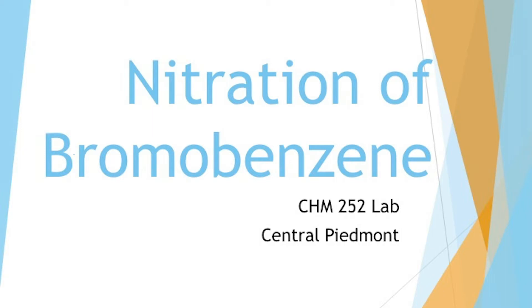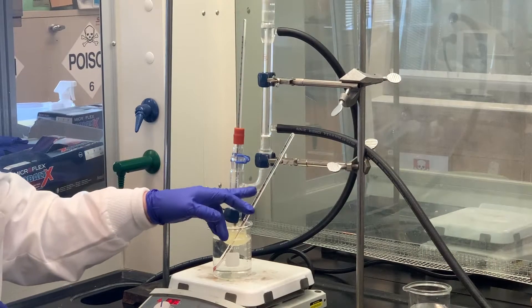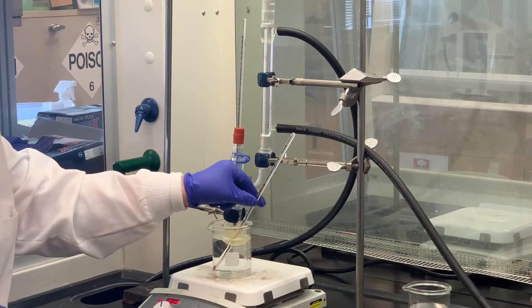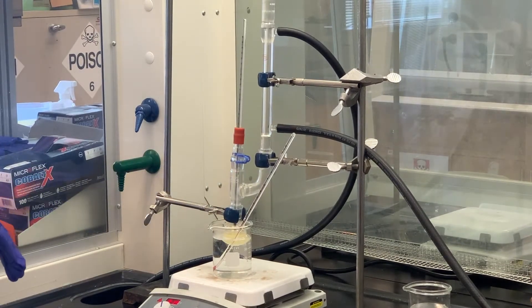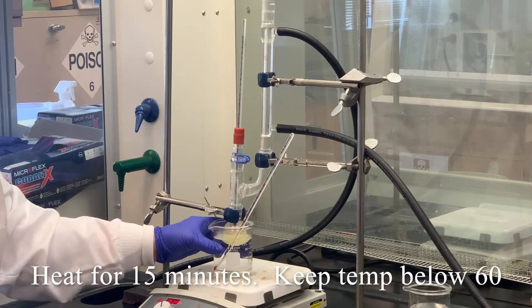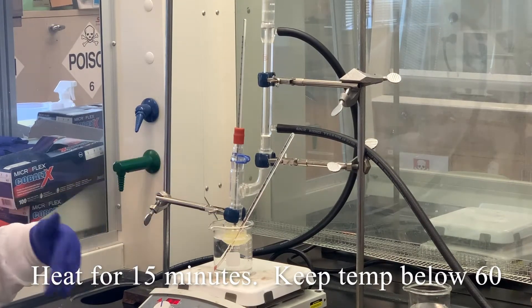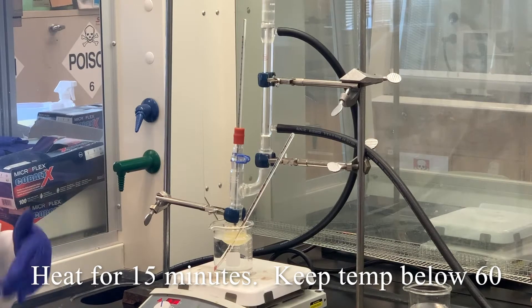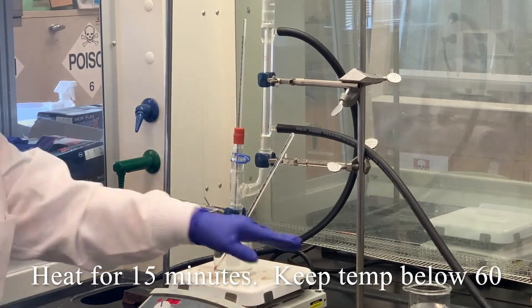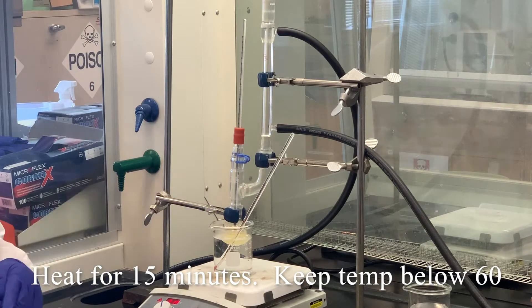We're at 50 degrees inside the distilling flask, and the water outside the bath is around 52 degrees. We're going to start counting that 15 minutes now. I'm going to check in between to make sure the temperature isn't above 60. Ideally we want it below 60. I've got some cold water there if I need to put it into the beaker to chill it — I have it ready.